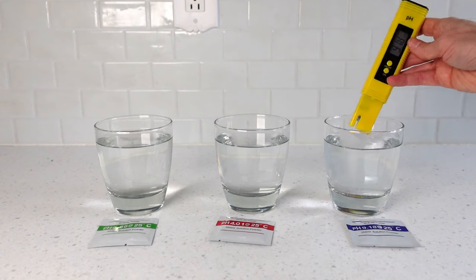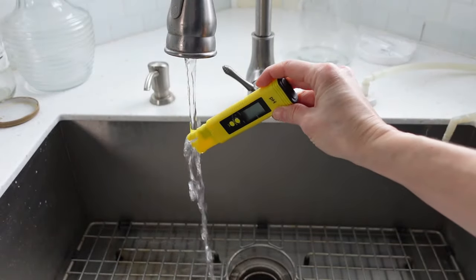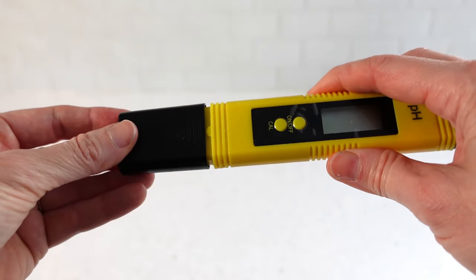Rinse the meter, but do not dry it off this time. The instructions say not to let the pH probe dry out. So when done, rinse it with regular water and place the lid on it while still wet. Note that the water only needs to be distilled water for the calibration process.